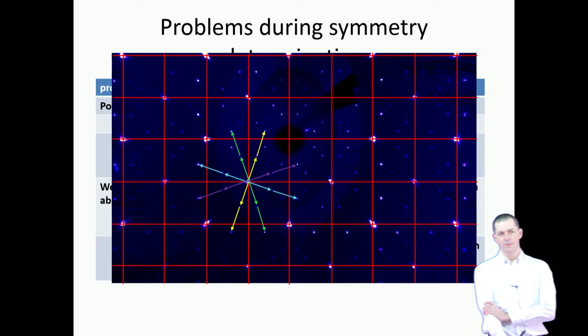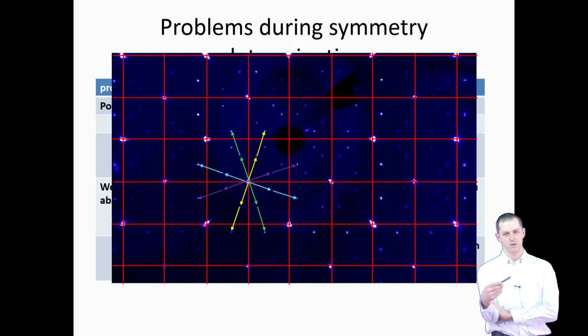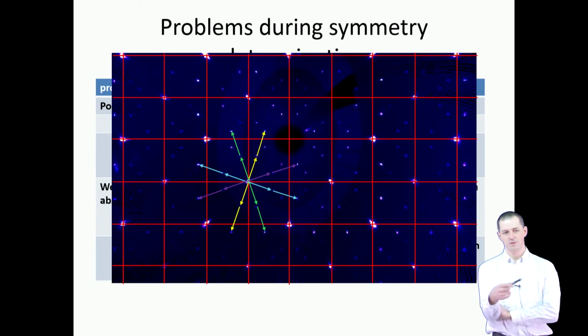There is probably no software that will tell you this as an answer. You need to see this in the diffraction pattern. You need to contemplate this, maybe gather some experience by going through examples, through your own problems. The first one will be painful.